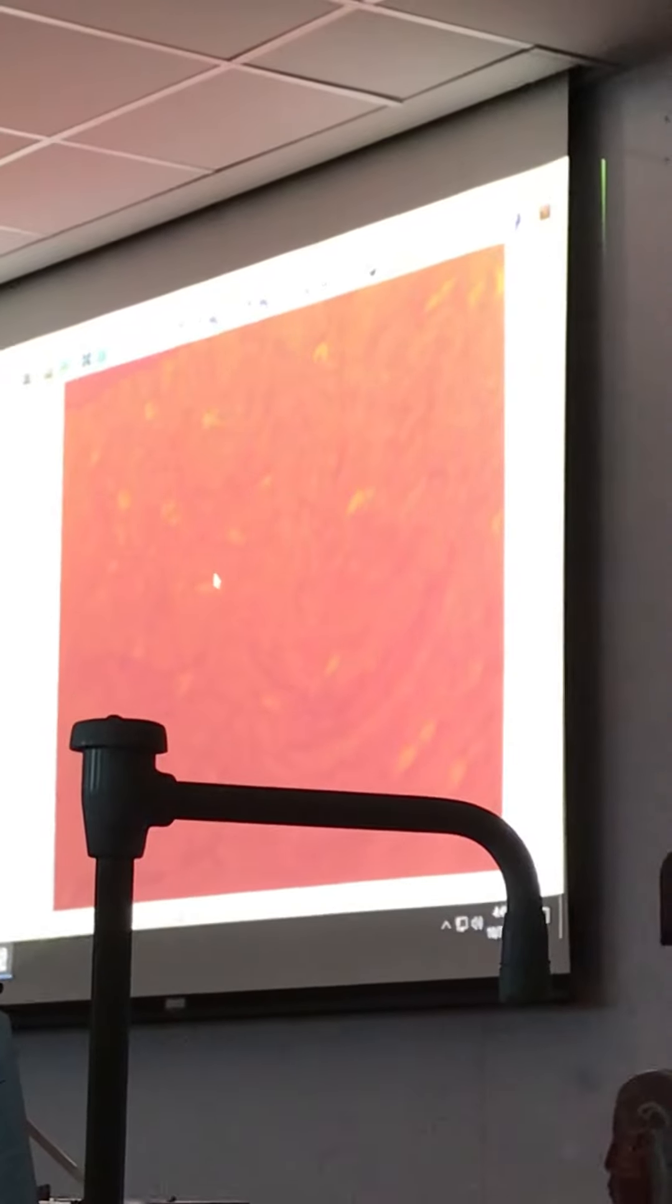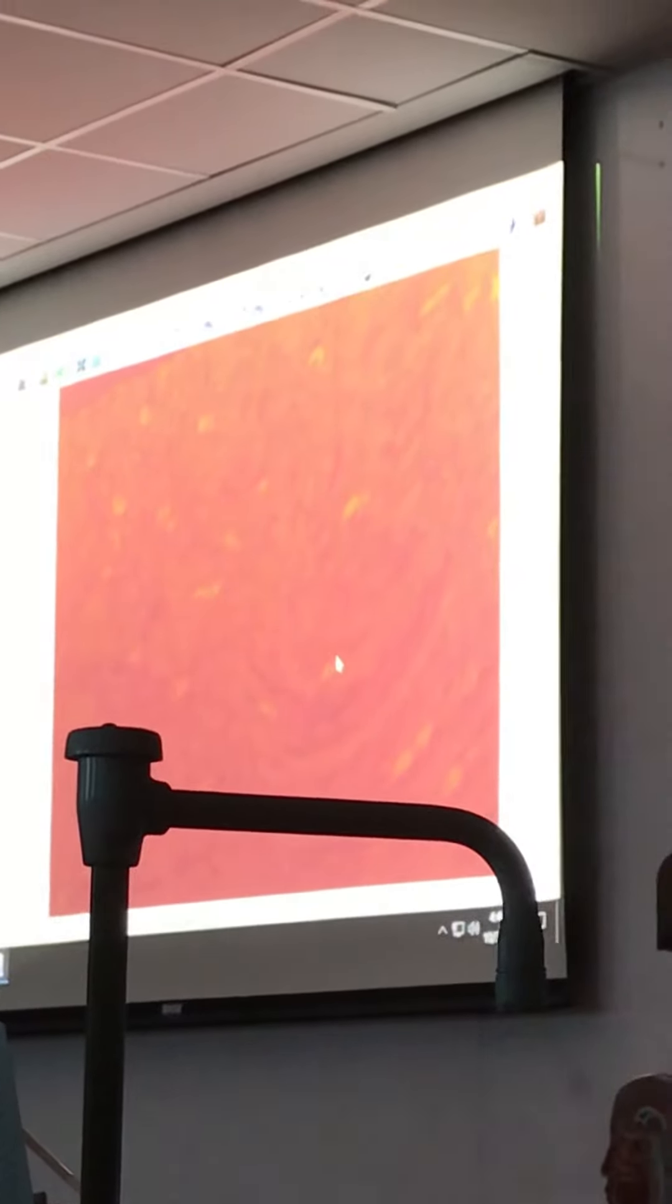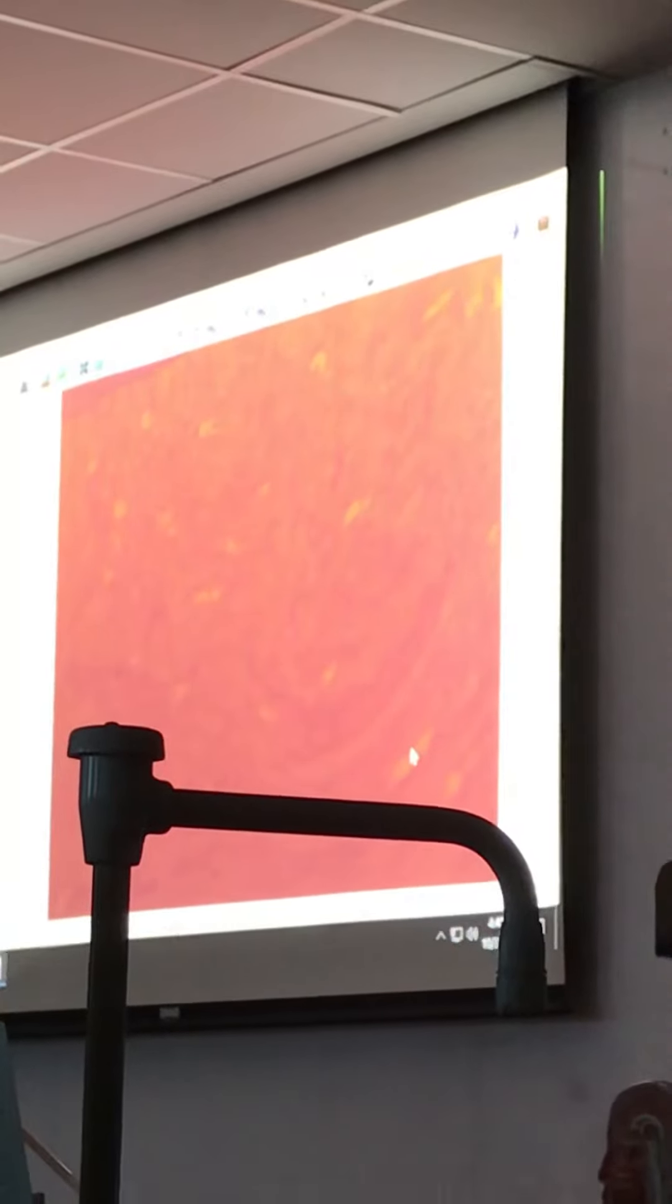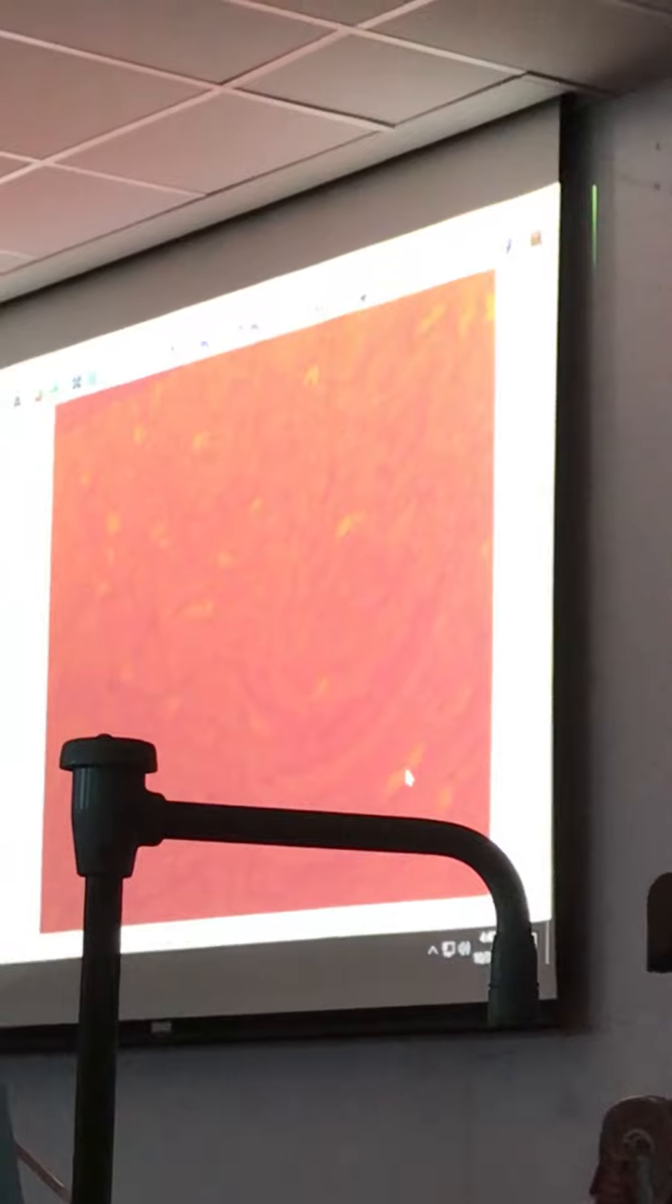So you have to look for these specific parts where you find clear spaces, slightly constricted areas of the myelin sheath, and these are your nodes of Ranvier.